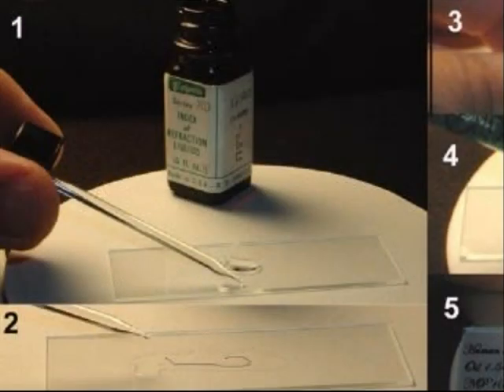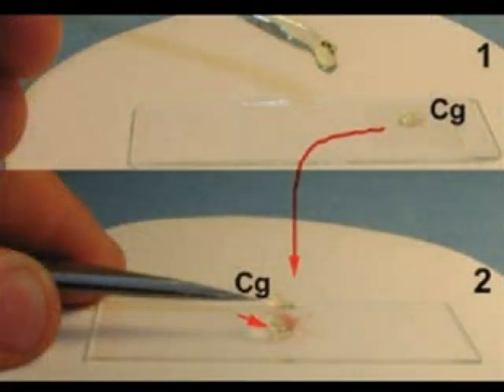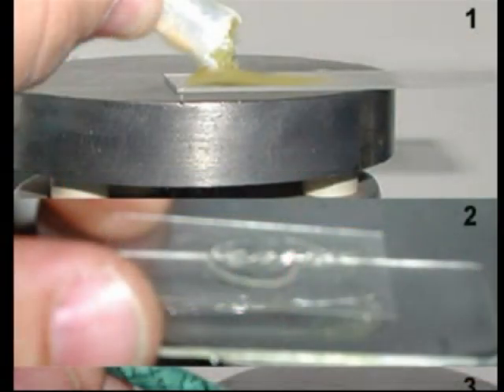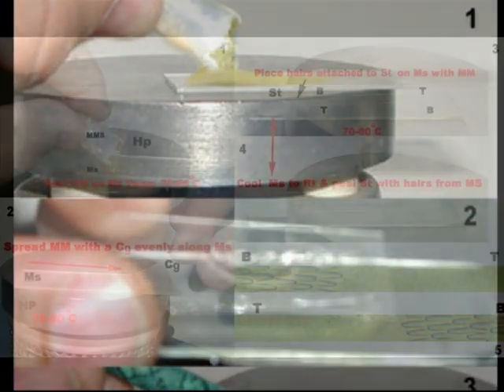Hair and fiber specimens should be mounted longitudinally in a mounting medium with a refractive index between 1.51 and 1.56. This includes a temporary mount in Cargille refractive index oil. Permanent mount in either Permount or melt-mount 1.539 media can be kept for many years. They are both very stable and chemically inert to a wide variety of materials. If mounting media is done properly, the materials or specimens do not change and will remain in place. These are best for collections of hairs, fibers, pigments, minerals, and other substances.